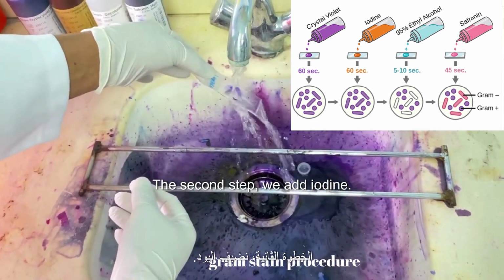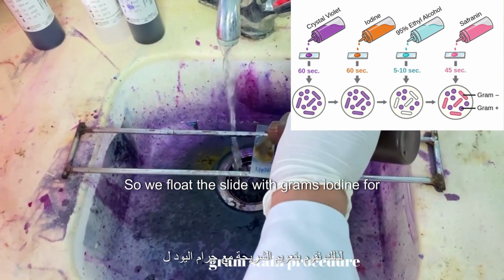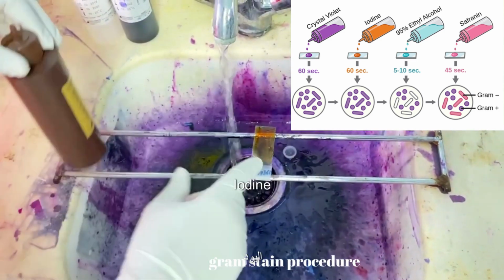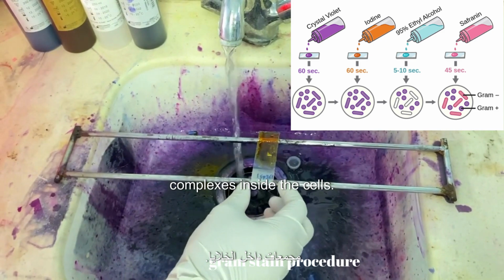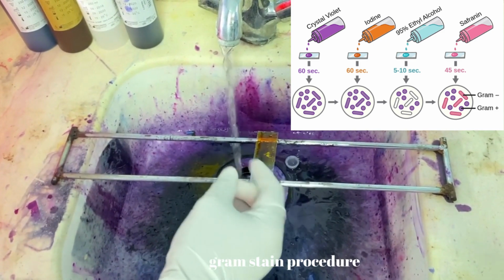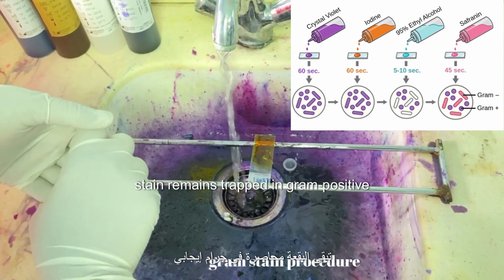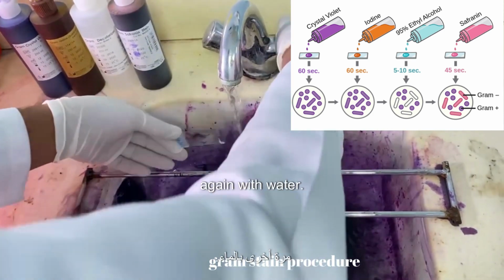The second step, we add iodine. So we float the slide with Gram's iodine for 1 minute. Iodine binds with crystal violet to form a complex inside the cells. This helps the stain remain trapped in gram-positive bacteria. Then rinse again with water.